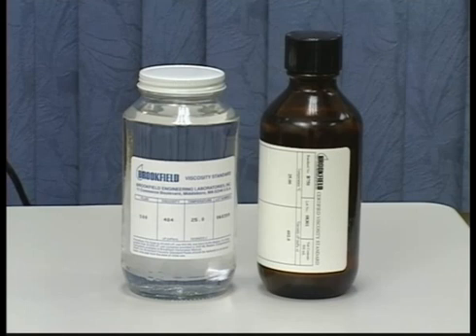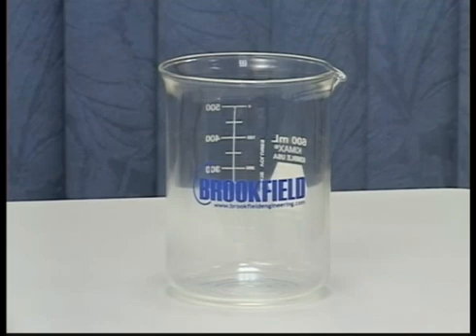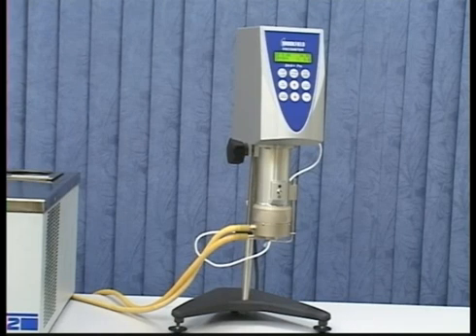You will need a silicone or mineral oil viscosity standard fluid, a water bath, and a 600 milliliter beaker. There are other instruments, such as a cone plate configuration, that require a different method for calibration. Those will be dealt with in subsequent videos.